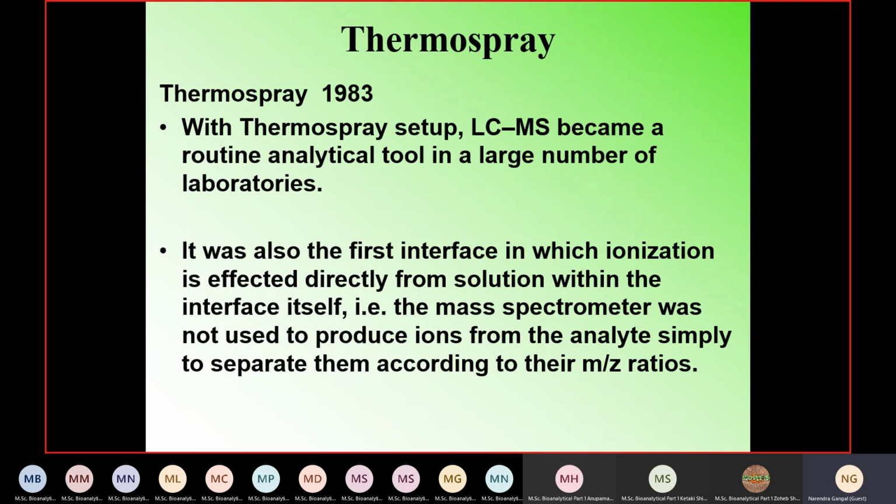Generally the HPLC flow rates are around 1 ml per minute, right? Everybody agrees with this or no? Yes, sir. They may be different a little bit. Some of the LCs will have very low flow rates. Can anybody name which are the LCs where you have very low flow rates? You must have learned a lot last year about HPLC and various techniques in HPLC. A special technique, which is most popular today.